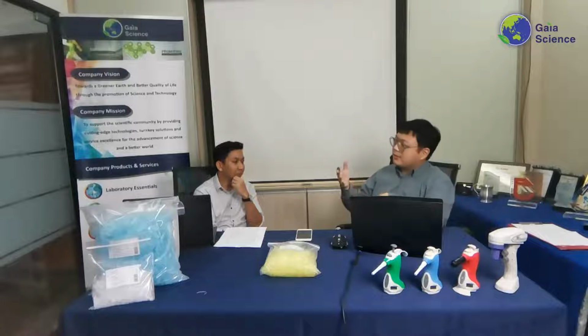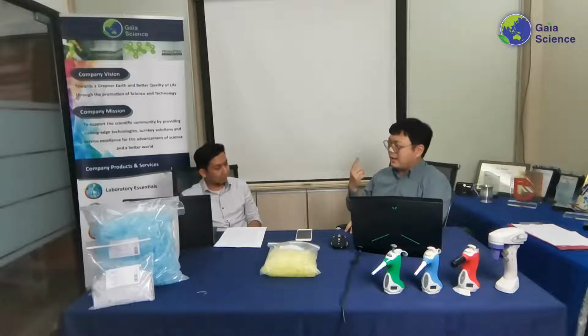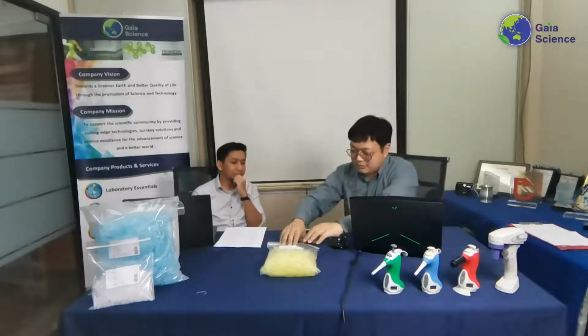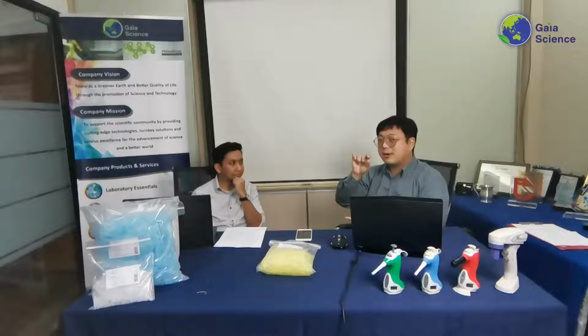Okay. Now, in terms of the purpose, it's actually quite interesting. So the first one is that you would prevent any item from going inside the pipette. I think that's the obvious one if you think about it. The pipette, if you've seen the tips, I'm sure you can put a picture up there, would have a filter right at the top.